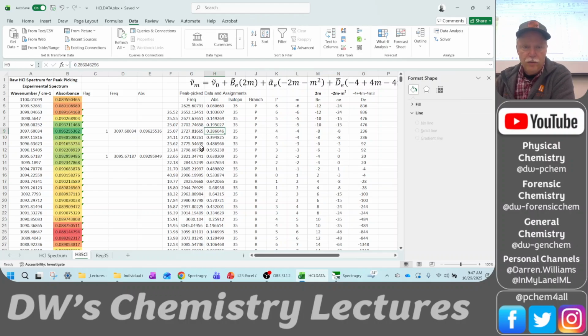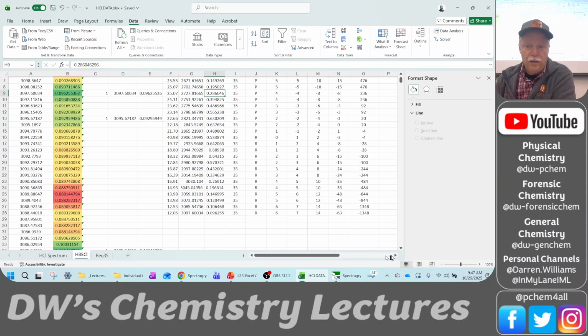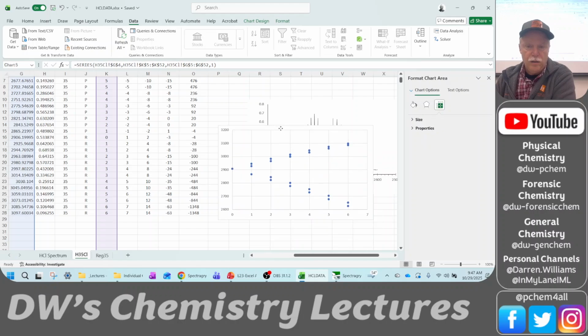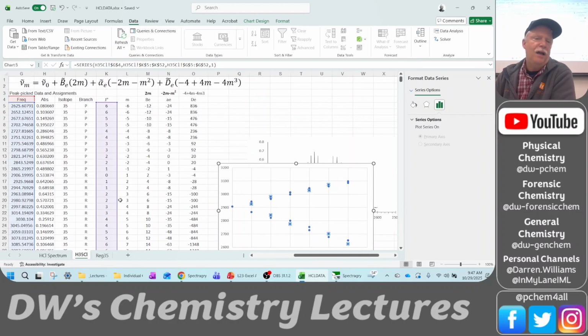Okay. So, did our frequencies, isotopes, looks like we've done everything. Oh, okay.